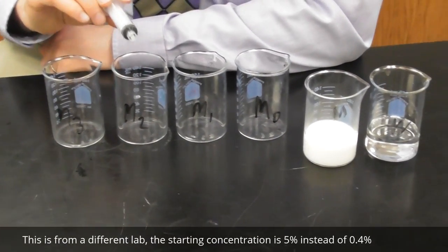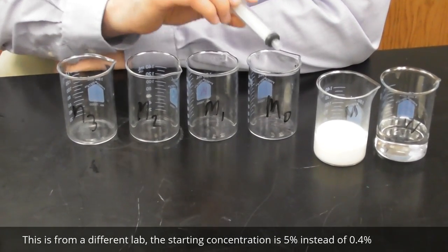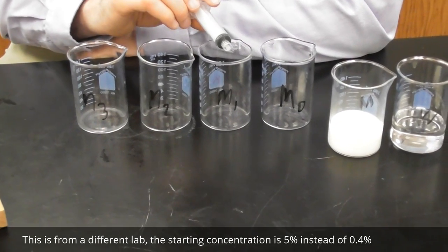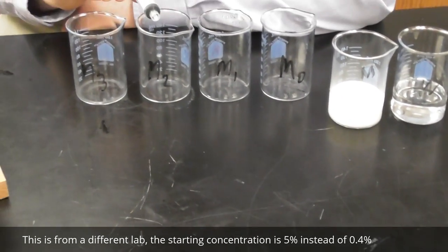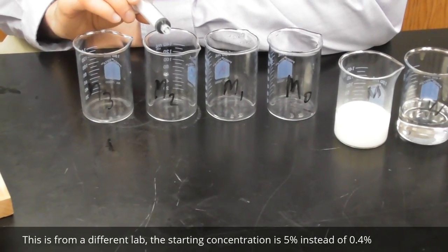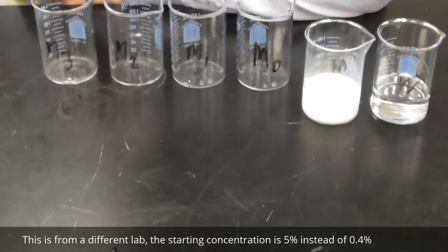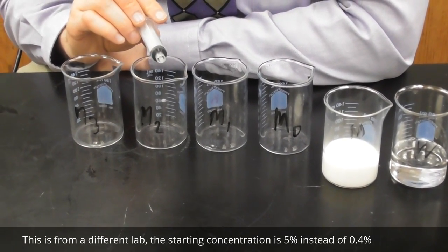Then I would take another 10 cubic centimeters. If I'm putting 20 in here, then I'm putting 10 in here and 10 of water in here, I'd have 20 total. Then I take 10 of that out, I put that in here, I'd have 10 total. And then I would take 10 of water and put that in here. I would have 2.5 and 10 of water. That would make 1.25% triglyceride solution.